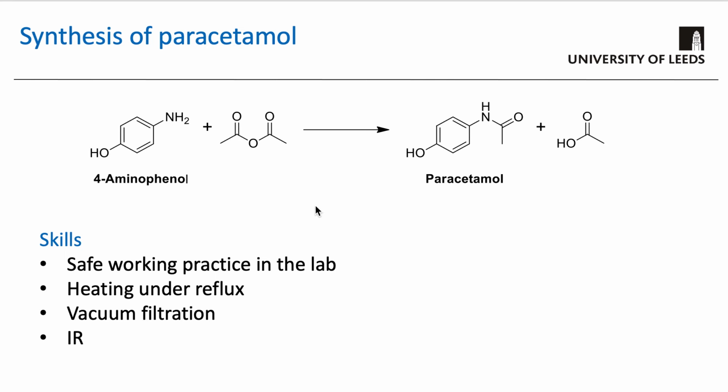Now, by doing this experiment, you're going to be learning how to perform standard techniques that we use to synthesize organic molecules and drug molecules, most of which are organic. The key skills you're going to be learning are how to heat a reaction together under a technique that we call reflux. This amide bond formation needs some heat, and I'll explain a little bit later why we need to heat certain reactions.